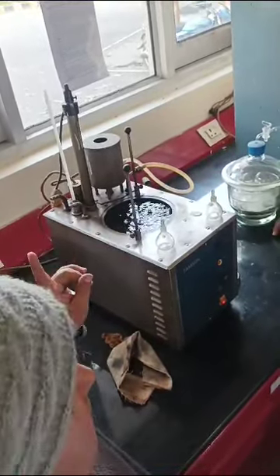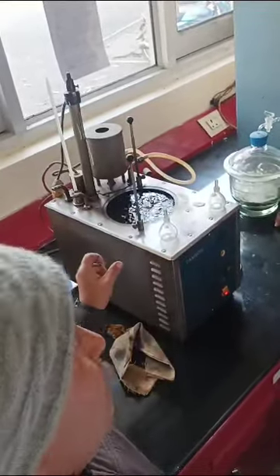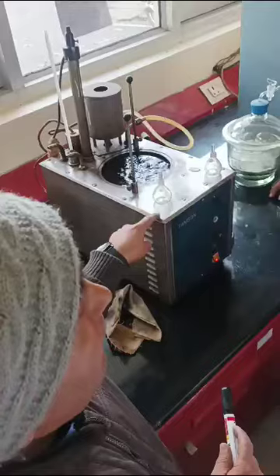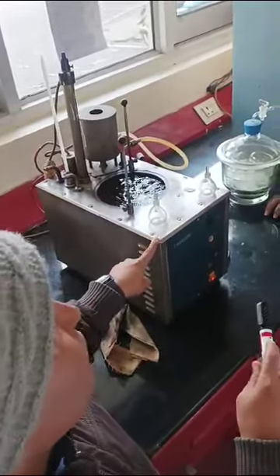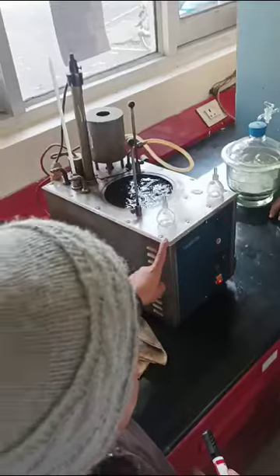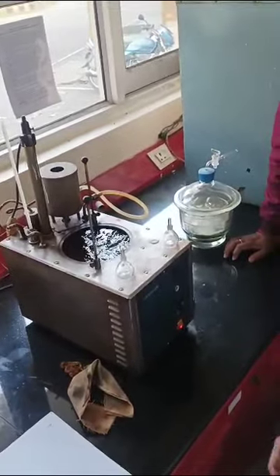Then you have the initial weight, you have the water equivalent weight, and you have the weight of the fuel. So the density of that particular fuel is equal to the weight of fuel divided by the water equivalent weight of the water. So you can say that it is the density of fuel divided by the density of water. Okay, that is basically the method. So let him complete first, then he will let you know the calculation part.